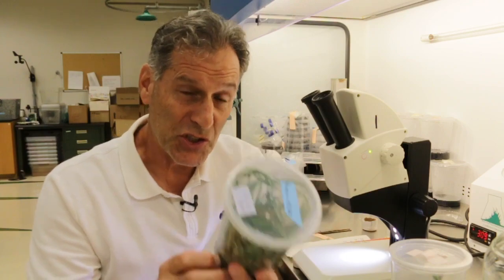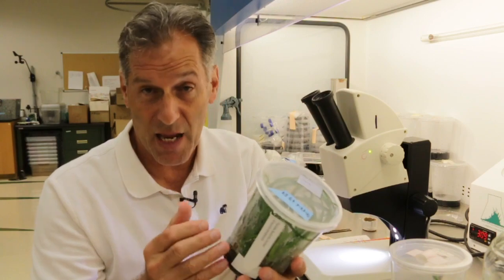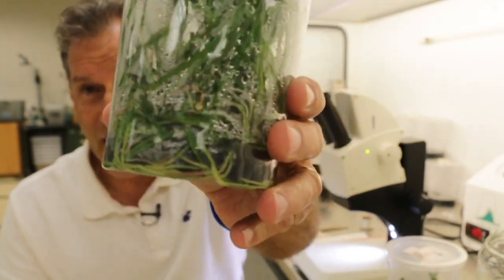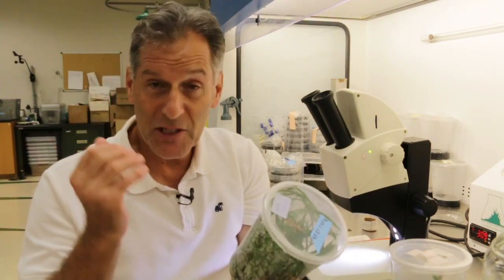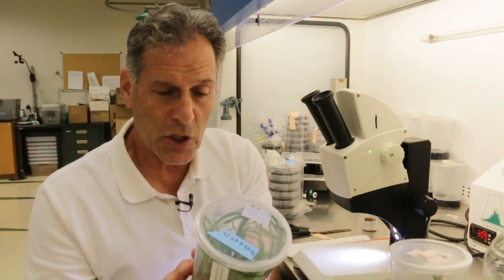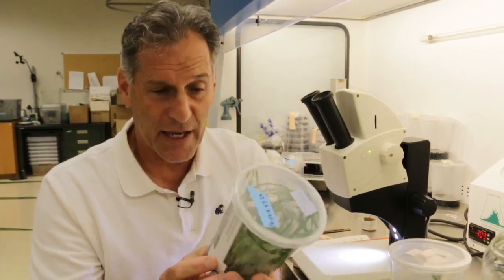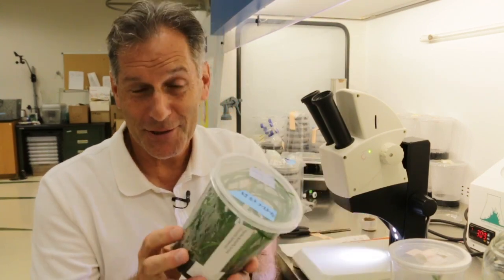The base of the leaves are swelling — they're starting to form bulbs, as Encyclias tend to do, and these things are growing pretty quickly. When these are deflasked, they also take off and grow really, really fast. The challenge when deflasking is to minimize root damage. You're going to have to damage the roots — they're so tangled you have to tear them apart a little bit. But what happens is you get a surge of growth. These plants are really big, very healthy, and doing quite well. The idea is to get big plants growing in these larger flasks to give them a jump on life and a boost to flowering.